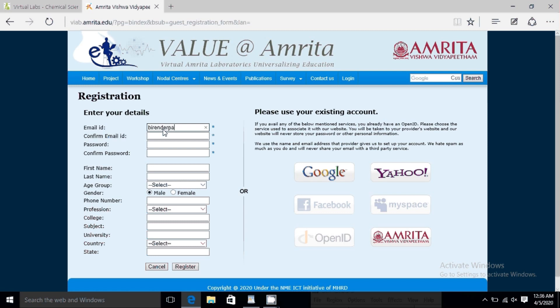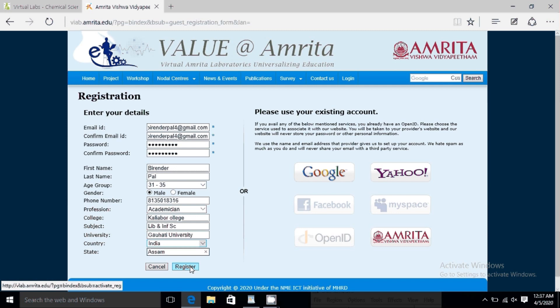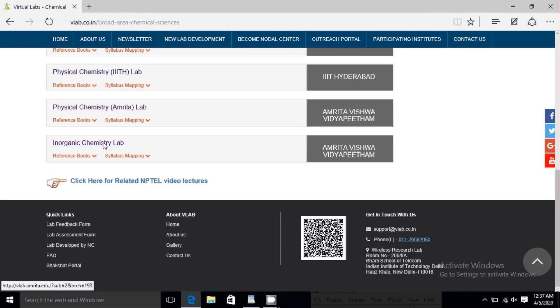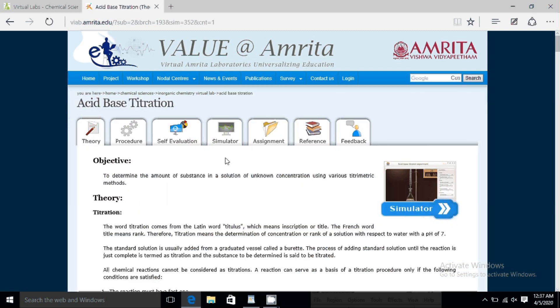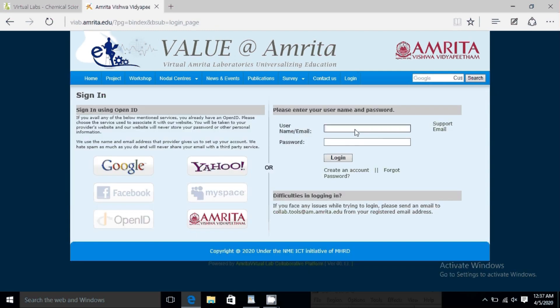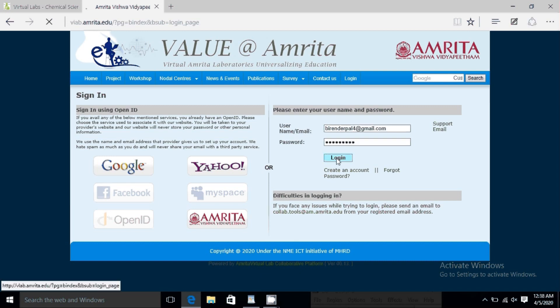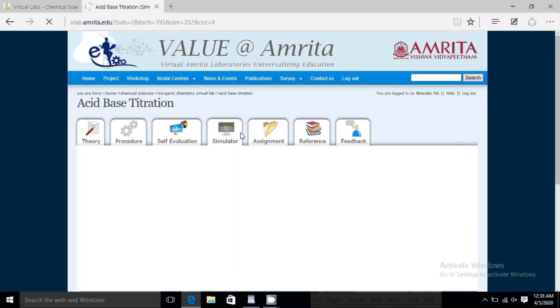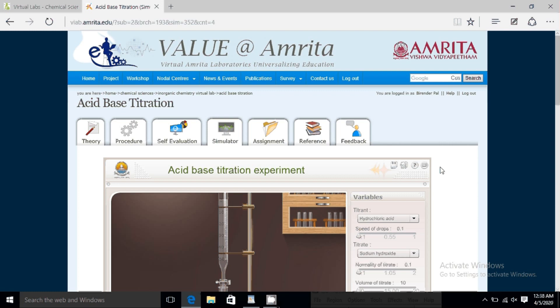Enter the password you want to use for this platform, then put the name of your college and register. Once you register, you log in through the account you have created. I will register with the account I have already created and then log in. Once you log in, you will be able to perform actions under the Simulator.